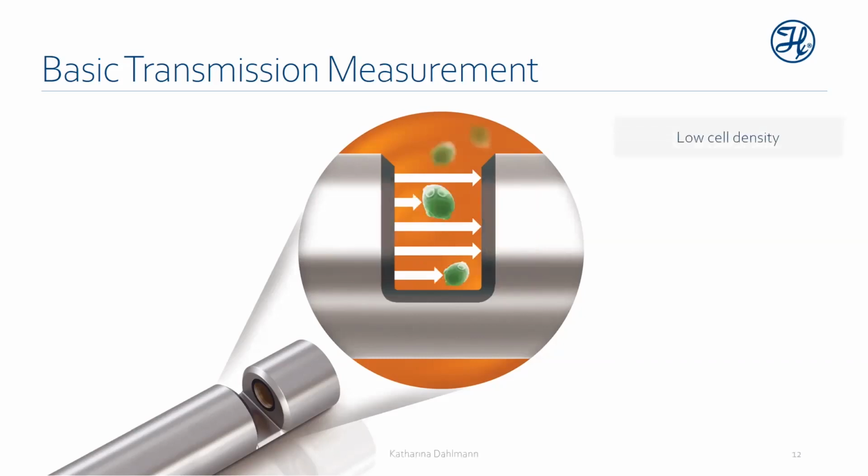In the presence of cells, the amount of light passing through from the emitter to the detector is going to vary, and it's going to decrease as the amount of cell density increases. At a certain point in high cell density processes, almost no light is passing through to the detector, at which point you either need an incredibly precise detector or an incredibly sensitive detector. You need to increase your light source, or you need to dilute your sample within the window pane in order to get back within specification, kind of like with the offline UV-vis spectrophotometer. You can't do that in process, so that's out.